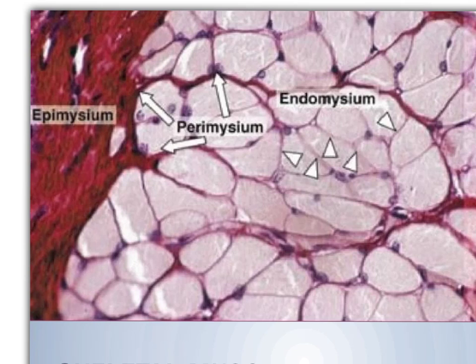Then from the undersurface of this epimysium we have finer, more or less dense connective tissue surrounding the bundles of the skeletal muscle fibers. This one is less thick and less dense, and it is the perimysium. It is formed of less dense connective tissue and also contains blood vessels and nerves, but of smaller size than the peripheral ones.